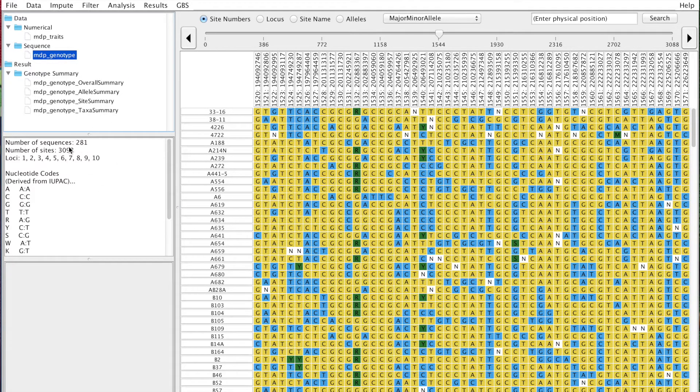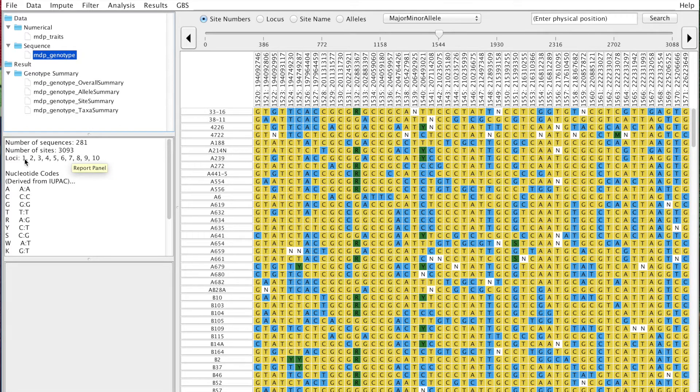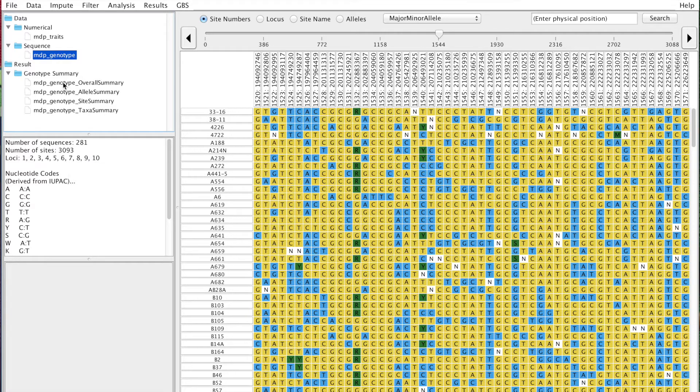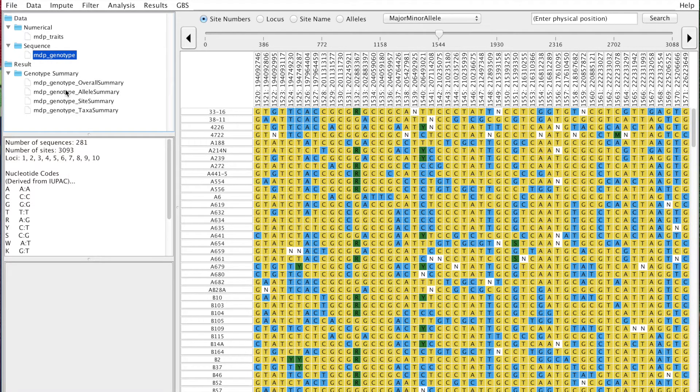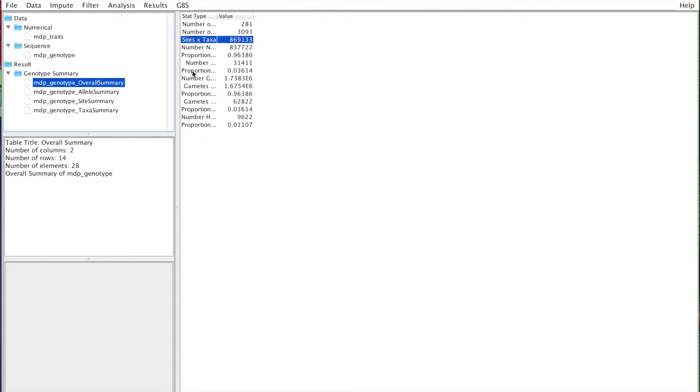When you go back to your genotype, you see that you have 281 sequences or taxa and 3,093 sites, and it tells you the number of chromosomes. All this information is already there, so the overall summary may not be as meaningful as you expect. There are other things like the number of gametes in the documentation online.